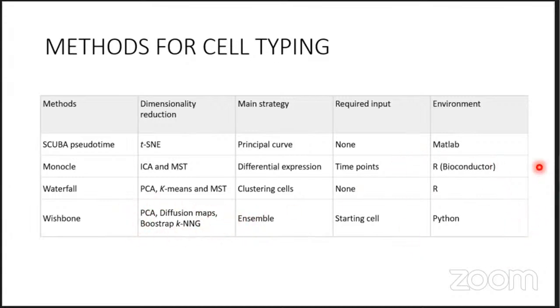So R and Python are very important when we create the PCA, volcano plots, heat maps, and clustering of the cells. One should have a basic understanding of R and Python. That is the basic requirement for single cell genomics. Though many free web servers are available now, I'll show you in the hands-on how we can use them. There we can upload our data, and inbuilt data is also there, which can be integrated with our data as metadata.